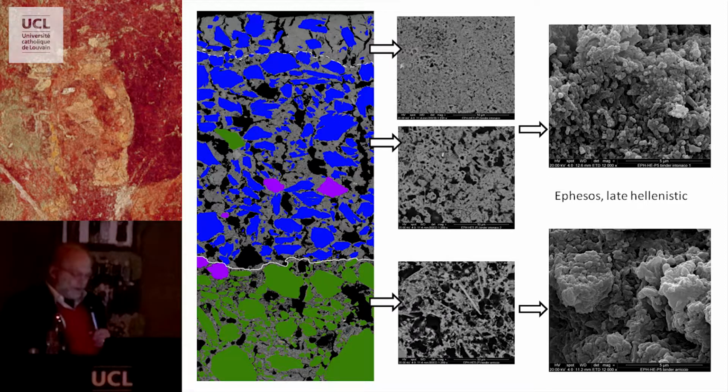You can see here only some silicate or dolomite impurities, but most is marble, and you can see different layers, which we can identify by their porosity. So this is a dense layer with shrinkage pores. Here we have most probably 2 layers of intonaco with air voids, so they were less compressed, and all this comes very close to what Vitruvius reports in putting up the Marmorino intonaco layers.